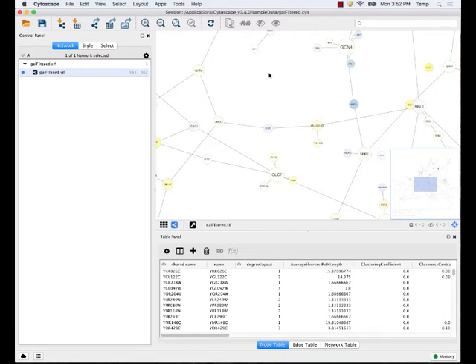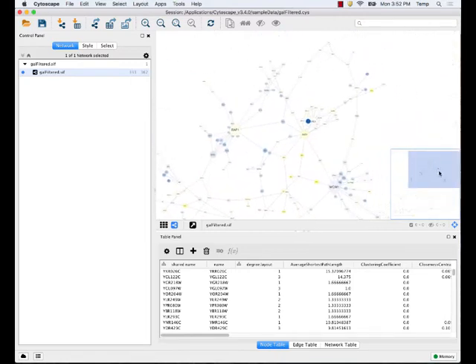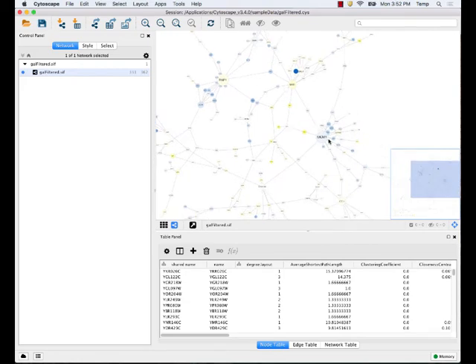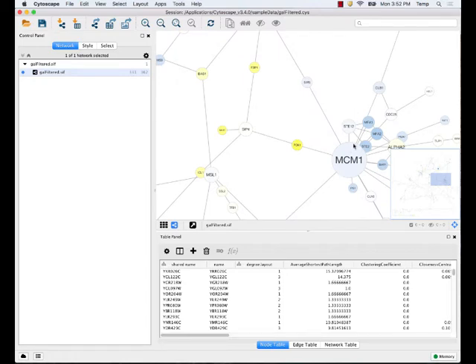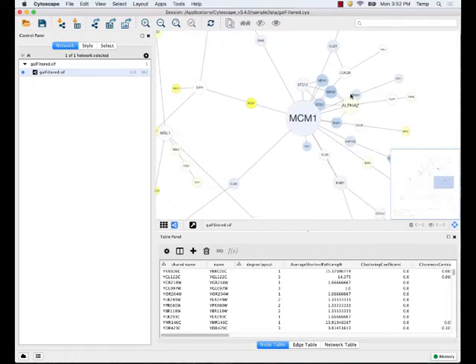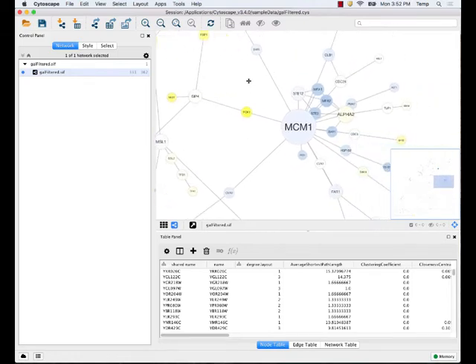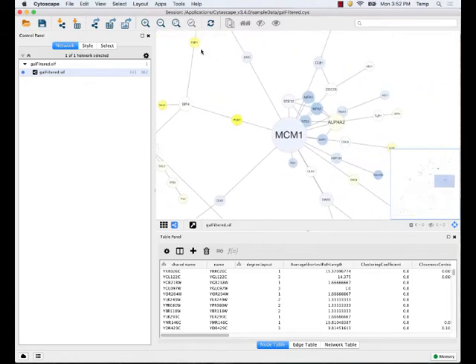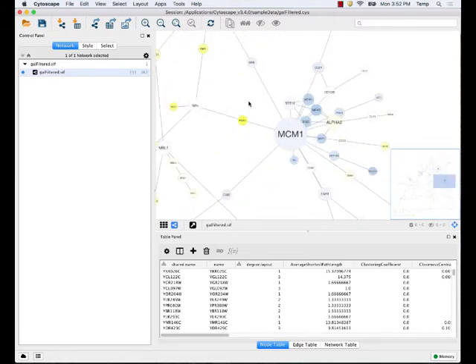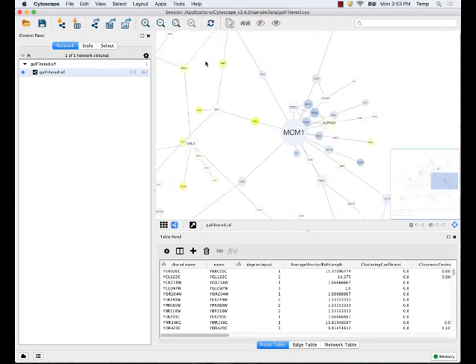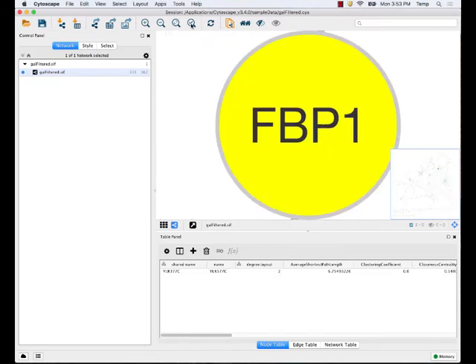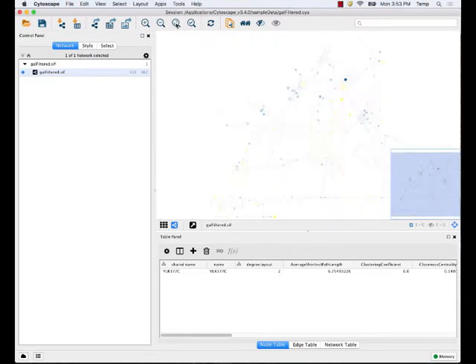You can use the overview box to move around. You can use your mouse scroll wheel or two-finger scrolling on Mac to zoom in and out, as well as these buttons here. You can zoom into something of interest, zoom out to the whole network, or zoom in and out incrementally.